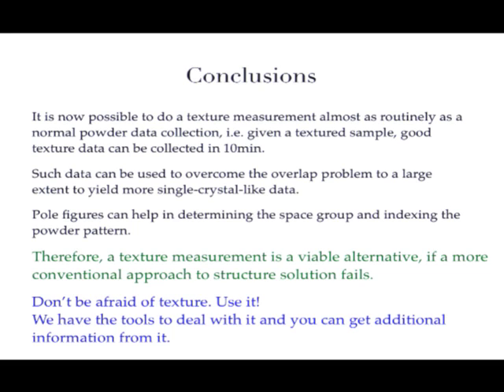There must be more questions. Yes, John. So in the optimized pole figure coverage, you had 300 random looking points. How do you come up with these points and decide which points to measure? They are separated by, well, you can do different optimization, but this one is 15 degrees between the orientations. Is that right?